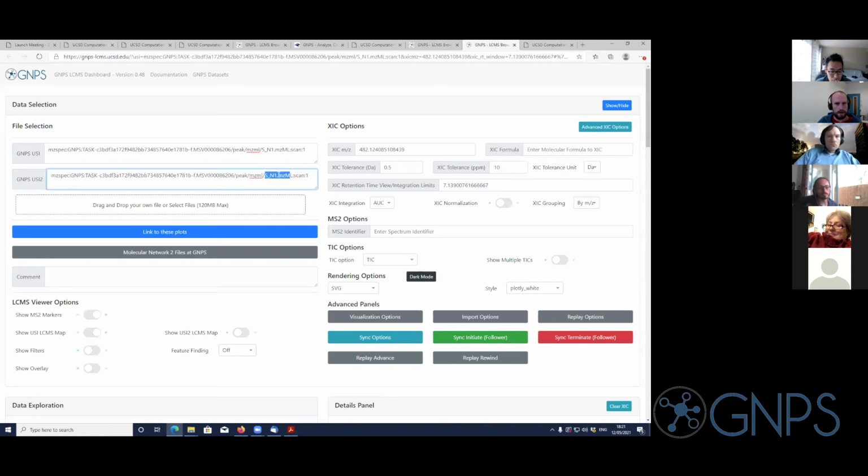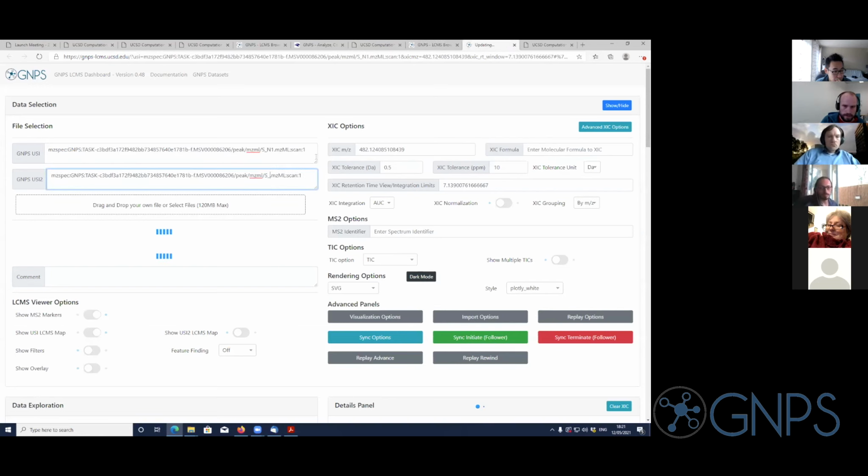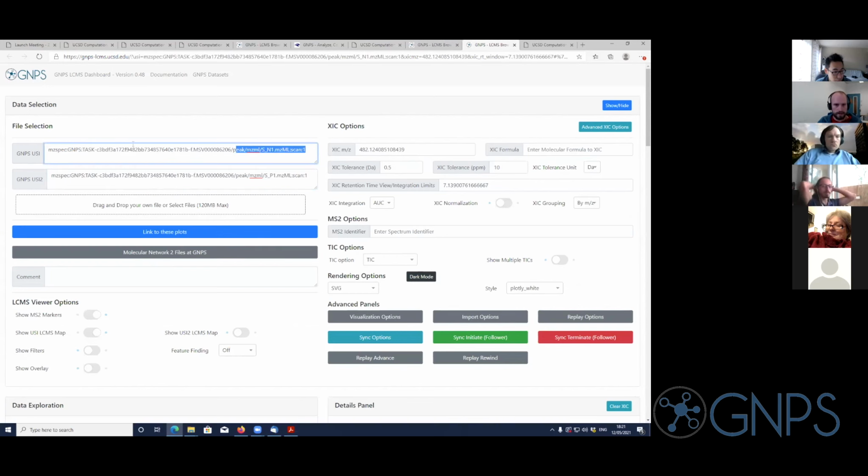So I could build this up together, right? If I just copy paste them.